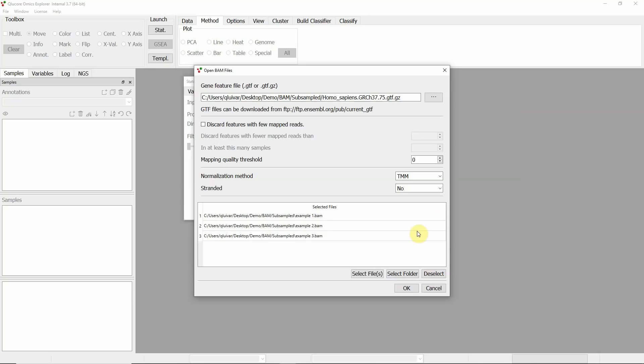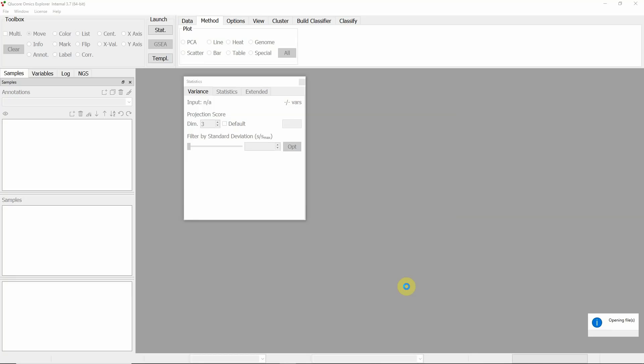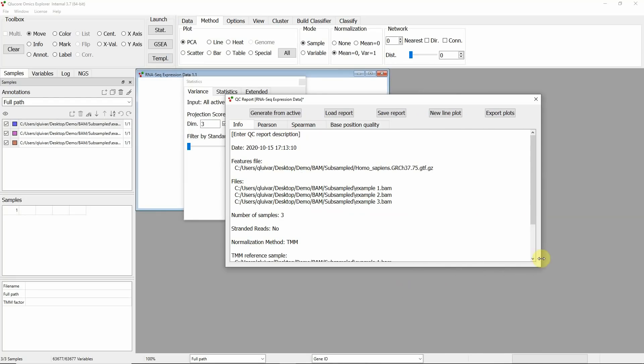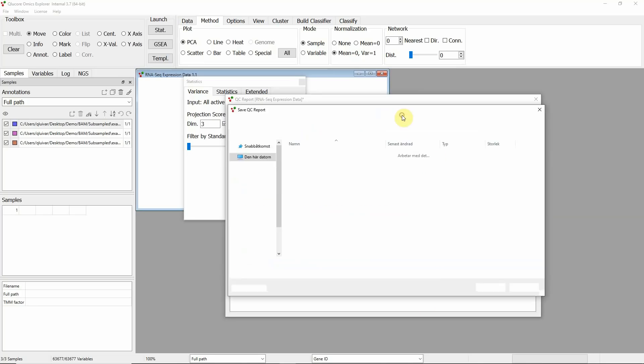GTF file is loaded and that takes some time. Then each BAM file is processed and finally the normalization is performed. Then the result is presented in a report which can be saved for later inspection.